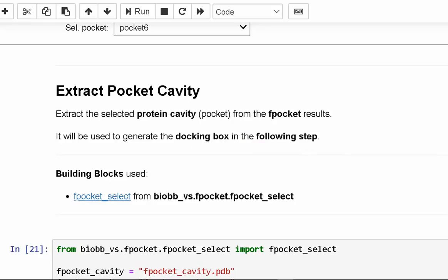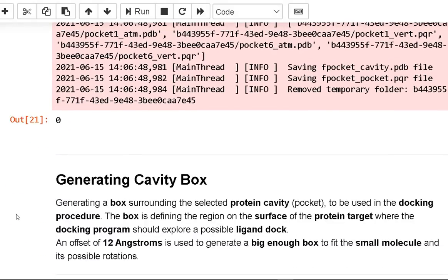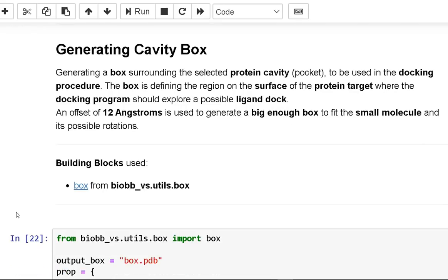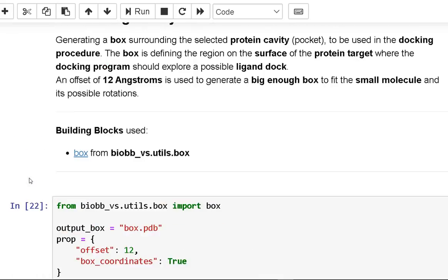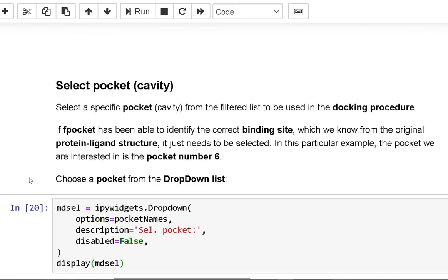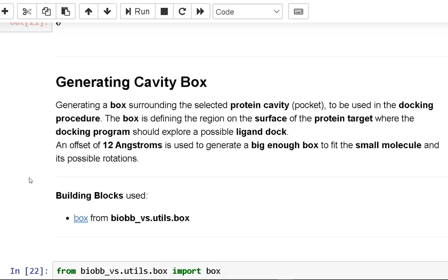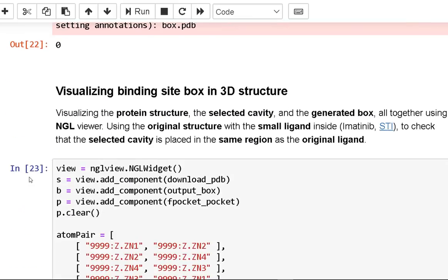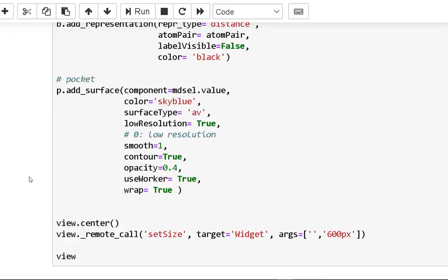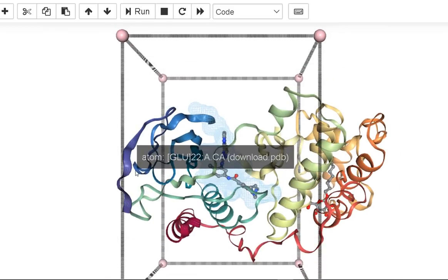For generating the cavity box, we create a box around the specified protein cavity to be used in the docking technique. The box indicates the area on the protein target surface where the docking algorithm should look for a possible ligand dock. To construct a large enough box to fit the small molecule and its various rotations, a 12-angstrom offset is used. Using the NGL viewer, you can see the protein structure, the selected cavity, and the produced box all at once.